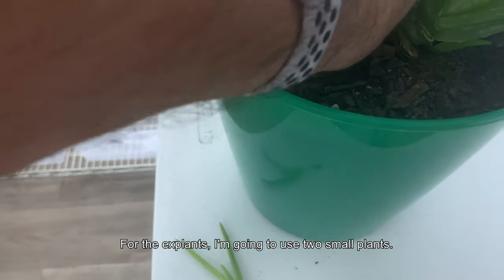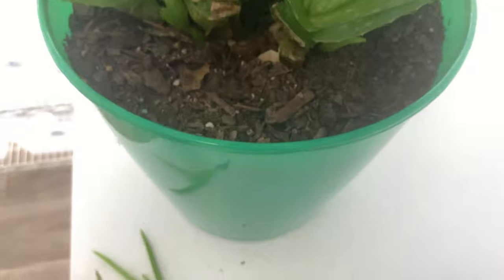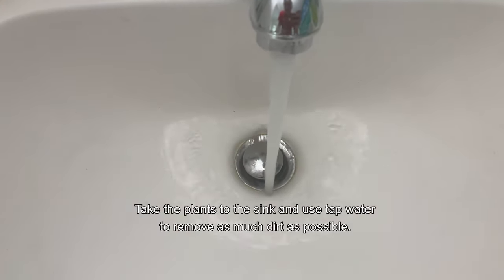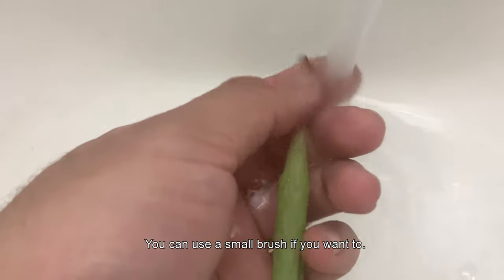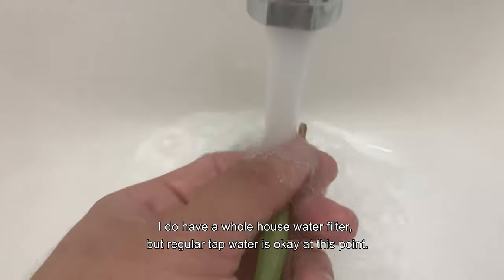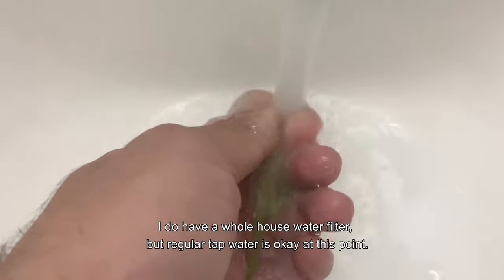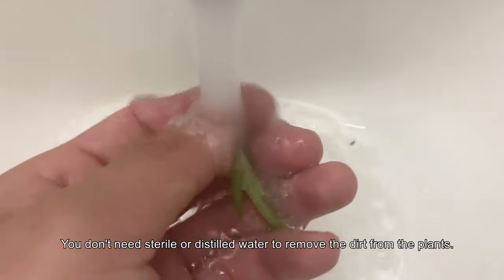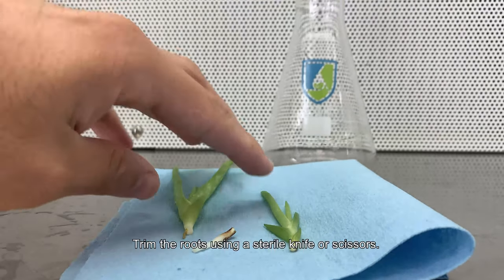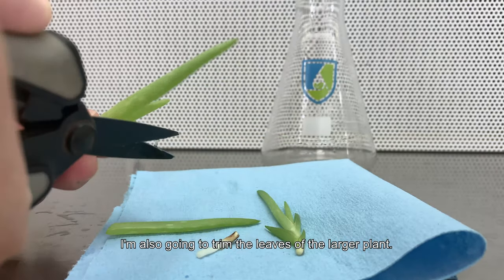For the explants I'm going to use two small plants, one larger than the other. Take the explants to the sink — I use tap water to remove as much dirt as possible. You can use a small brush if you want. I do have a whole house water filter but regular tap water is okay at this point; you don't need sterile water to remove the dirt. Trim the roots using a sterile knife or scissor, and I'm also going to trim the leaves of the larger plant.